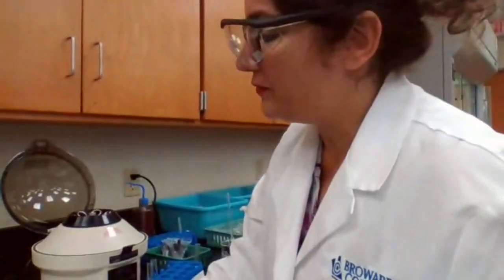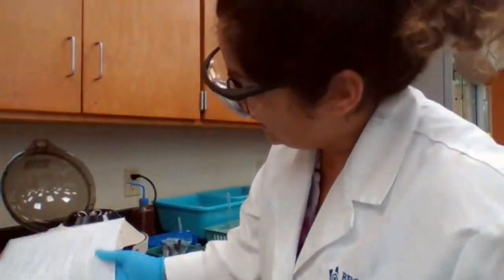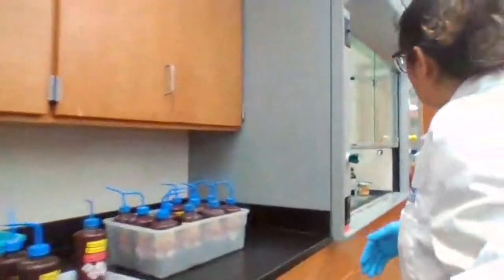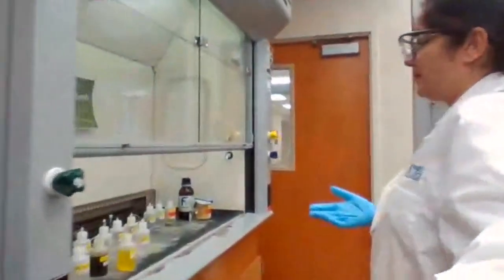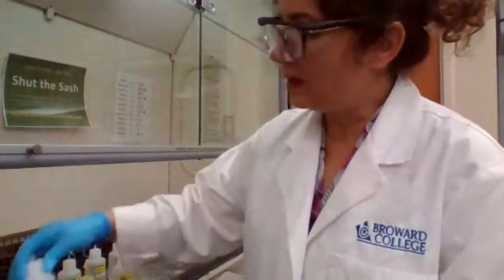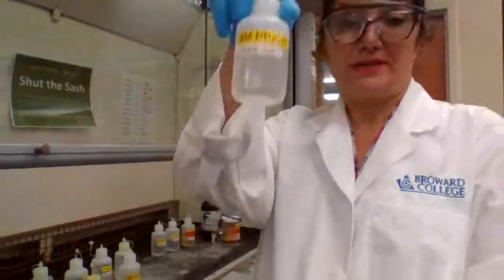And ammonia in water, let me see how many drops before I move. 10 drops. Ammonia in water is ammonium hydroxide. So when you say 6 molar ammonia, that should actually be 6 molar ammonium hydroxide. So it's the same thing.